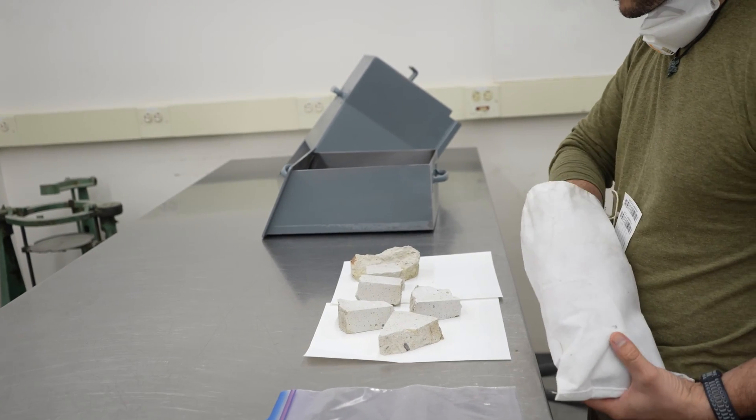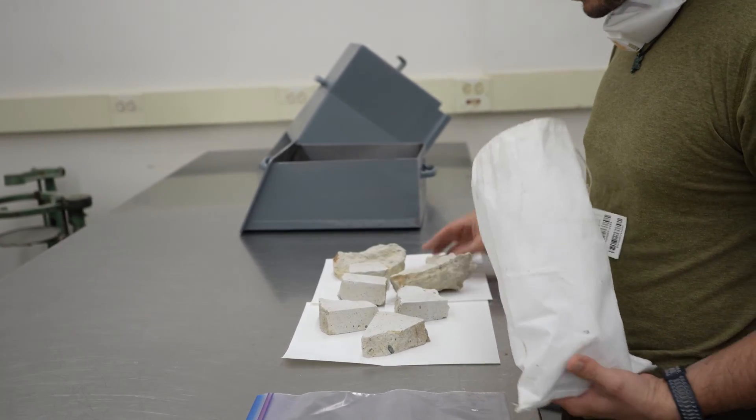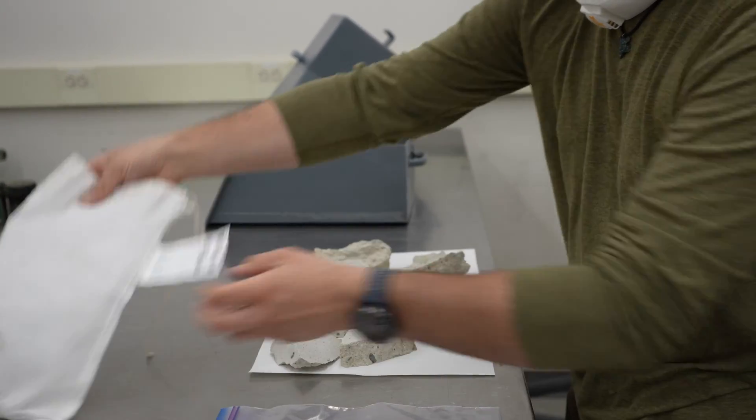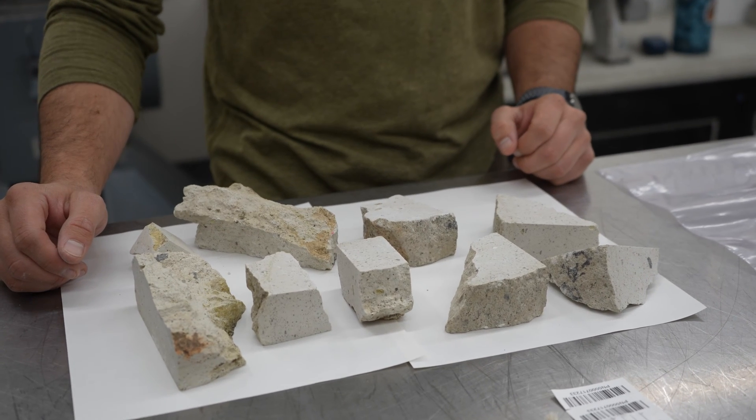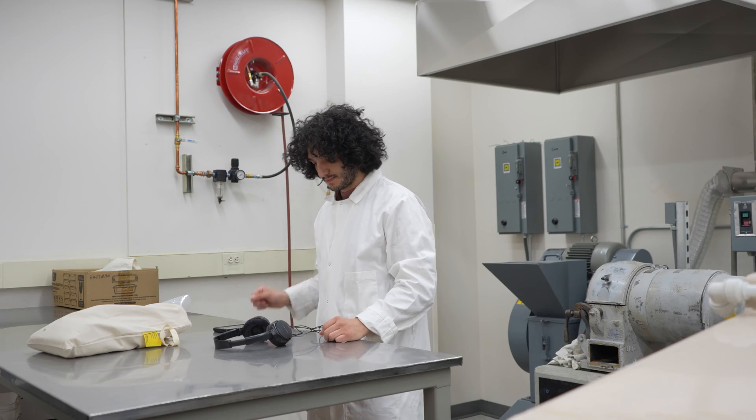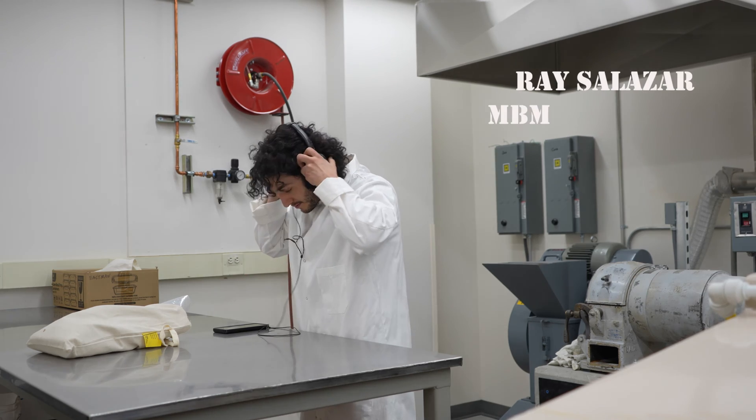The second step in our process is crushing each rock sample into a fine powder. We start with a jaw crusher to make pea-sized chunks and then a disc mill to grind the chunks into a fine powder. To avoid contamination, most of our time is spent cleaning the machines.